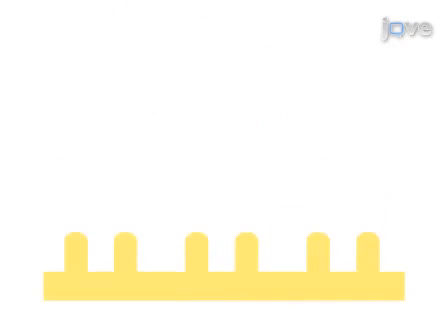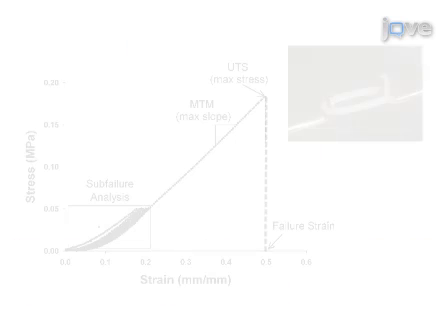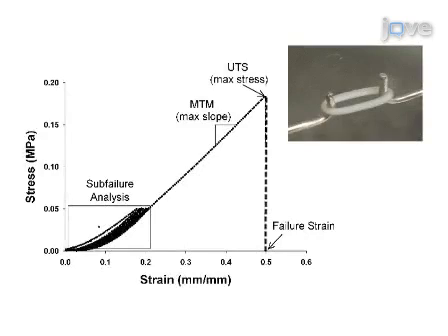Then, the PDMS template is used to form agarose wells. The final step is to seed cells into agarose wells to allow them to aggregate and form cohesive tissue rings. Ultimately, this method can be used to achieve cellular self-assembly and tissue engineering using different cell types, and enables analysis of the contribution of cells and cell-derived extracellular matrix to tissue structure and function.